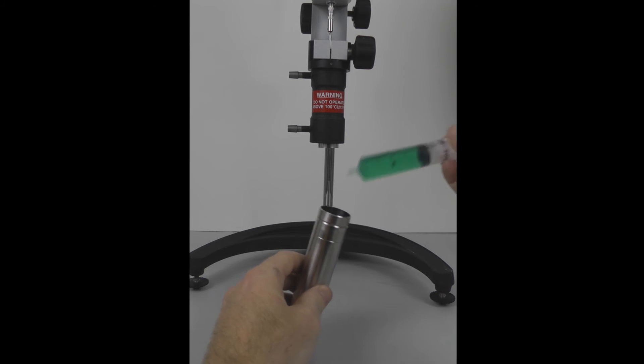In a closed tube system, the sample chamber uses an end cap and 16 milliliters of sample is required in order to make accurate measurements.